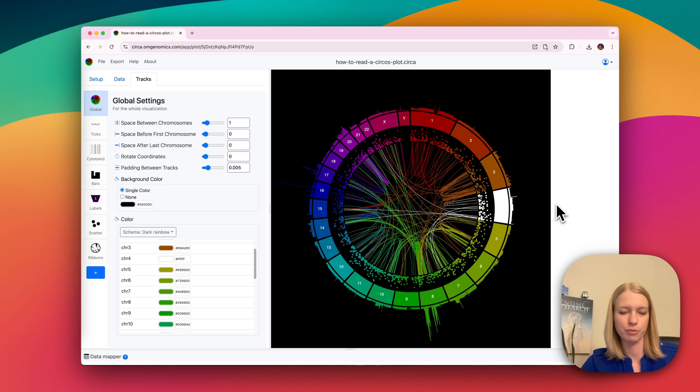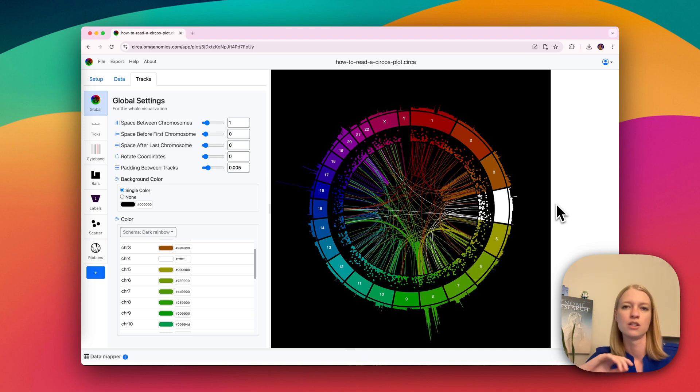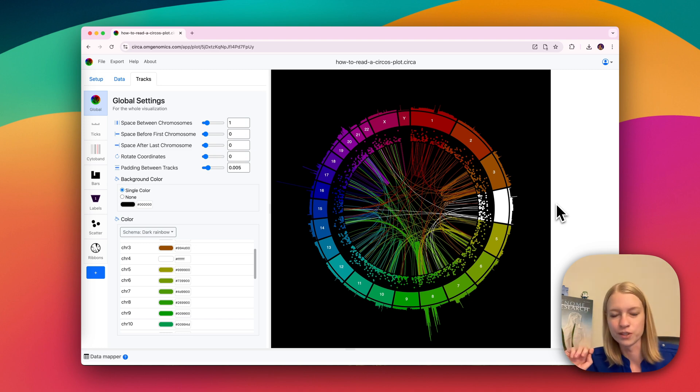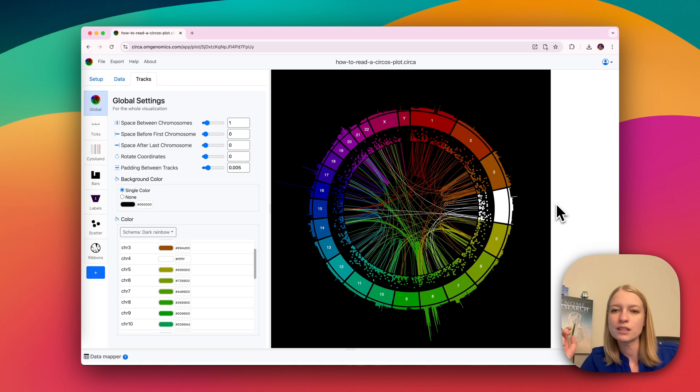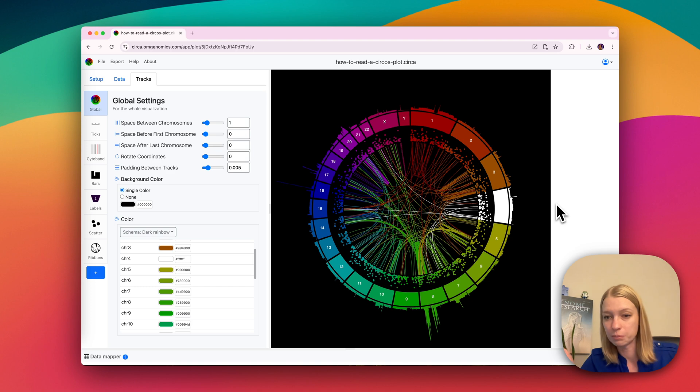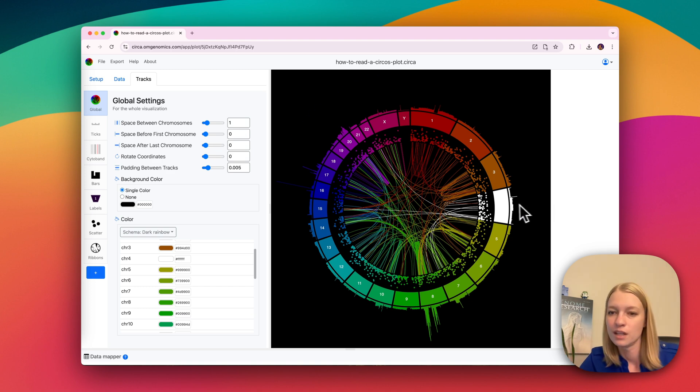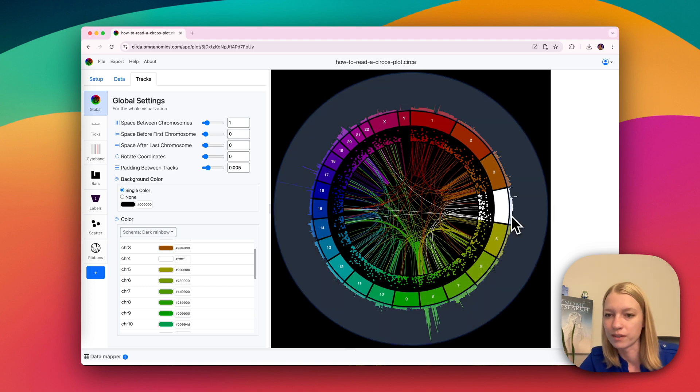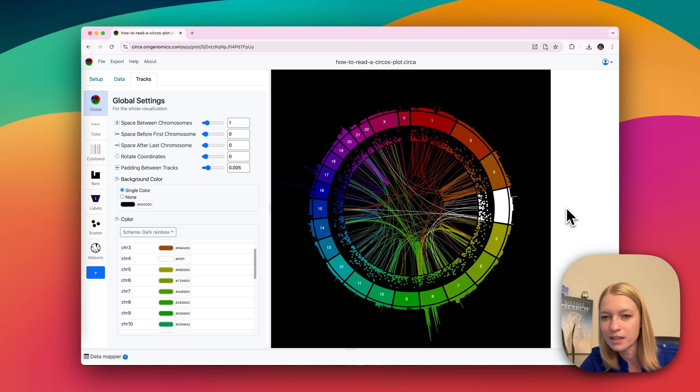So this is another common type of plot, not within Circa's plotting world. And basically, in Circa, we just call these chromosomes, but it can be any sequences. And so that's what a sector is, like the one shown in white here.